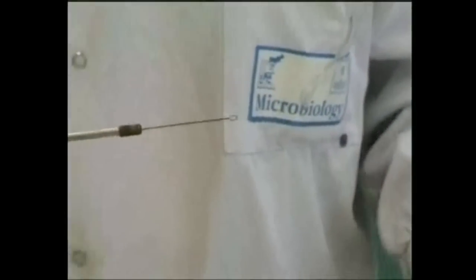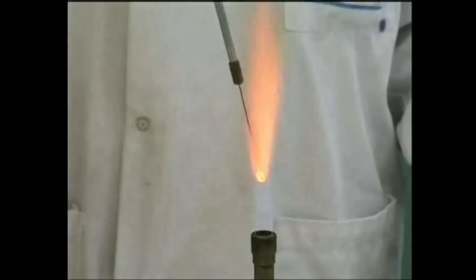After inoculation, the loop or wire should be re-sterilized by introducing it into the Bunsen flame, but slowly to avoid further aerosols. Just insert the loop into the pale blue cone of the flame.